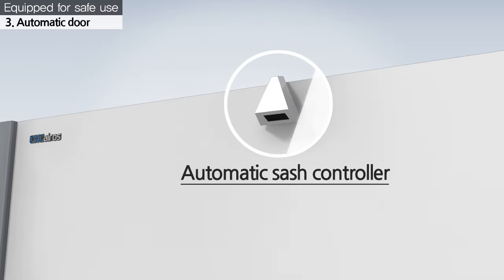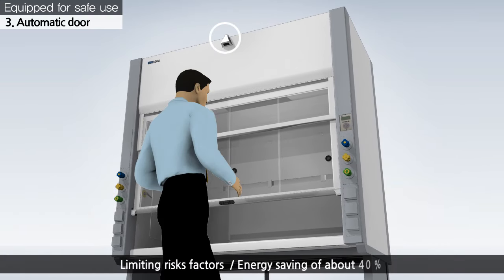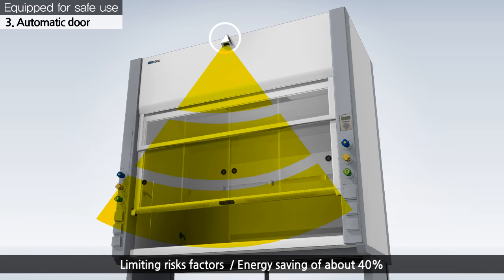A sensor on the door detects movement and automatically closes the door when there is no user in front. This automatic sash controller can save energy by about 40% and limits risk of explosion.